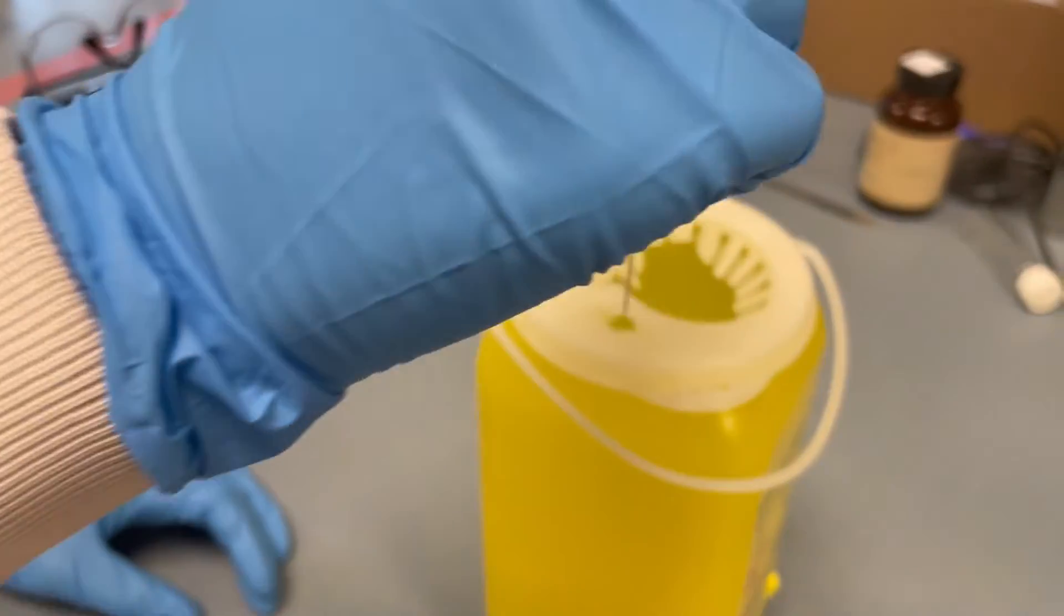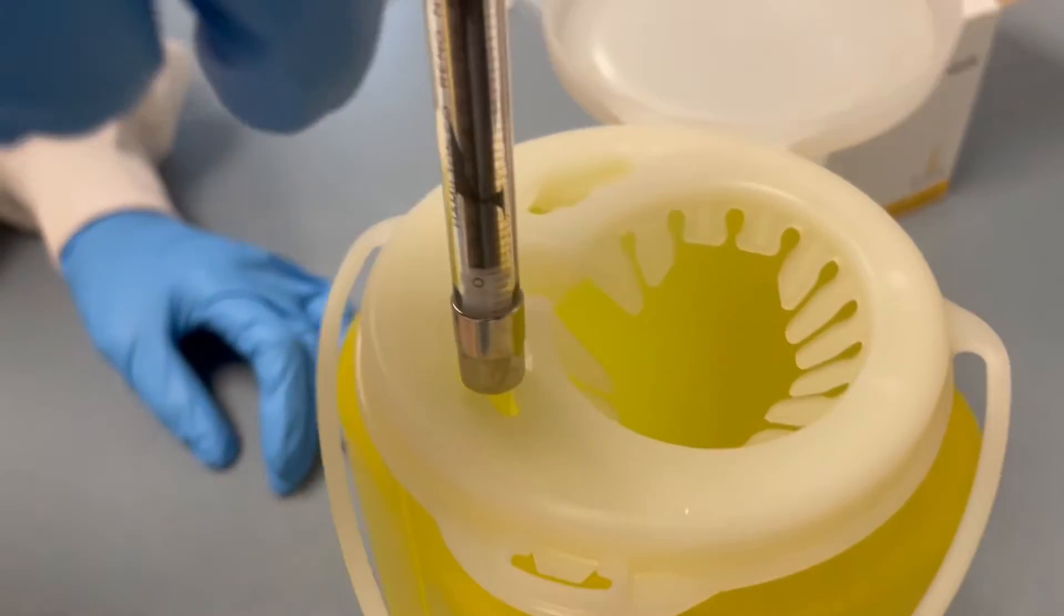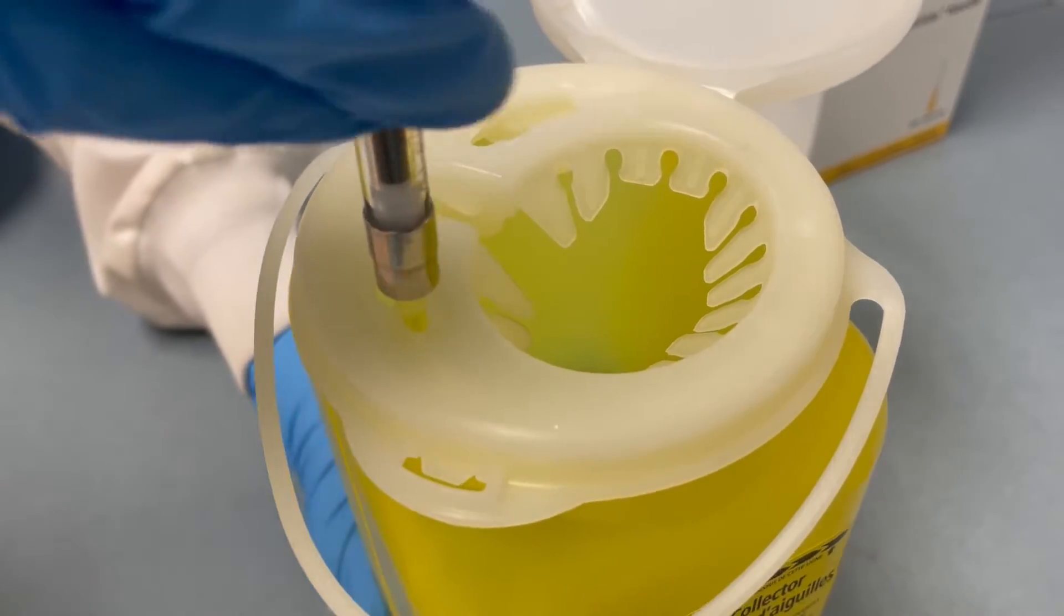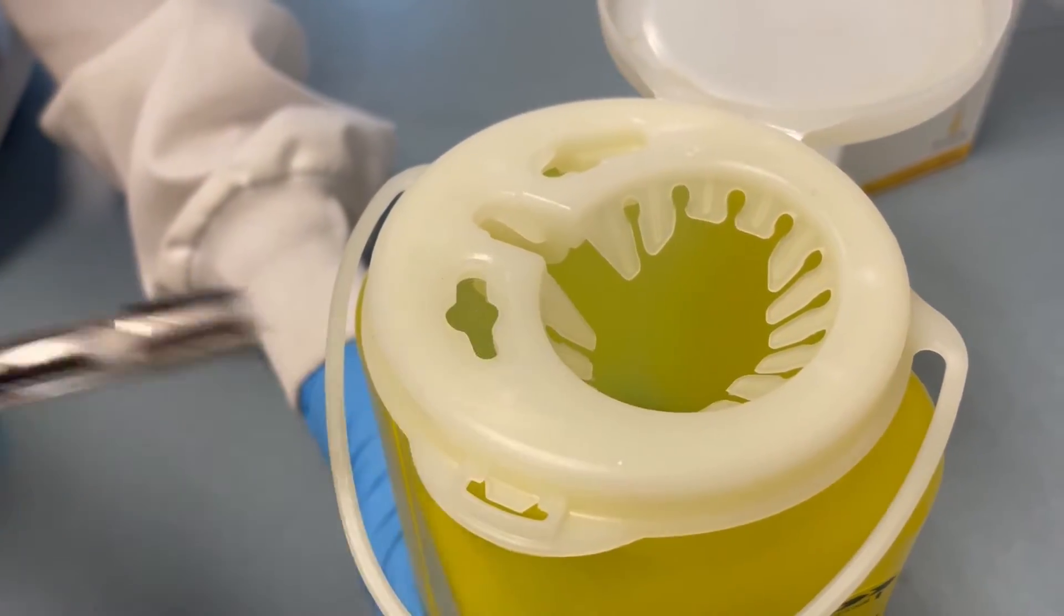To dispose of these needles you can insert them into a slot at the top of the sharps container and just twist them off and then knock them right in.